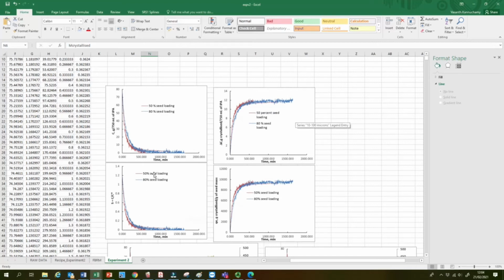So all these images are the same result but expressed in different forms. Here it's expressed in terms of concentration with respect to time. Here I mentioned it in terms of mass crystallized with respect to time. I already showed you how to convert your concentration into mass crystallized. You have to check part 4a and 4b, and then this is the amount of mass loaded per unit mass of your seed crystal. So how many grams of your paracetamol are crystallized onto unit mass of your seed crystals. Yeah.